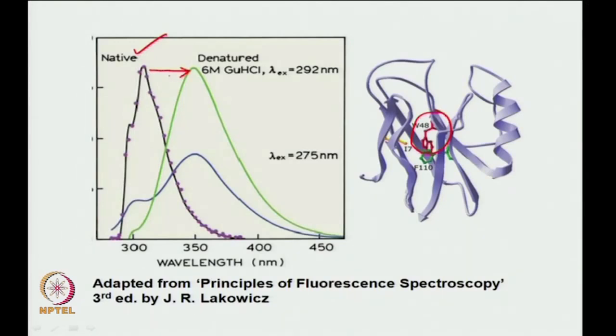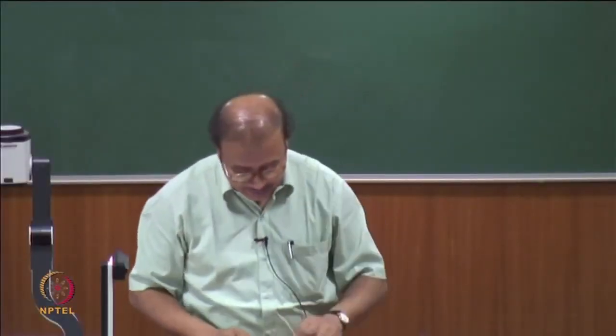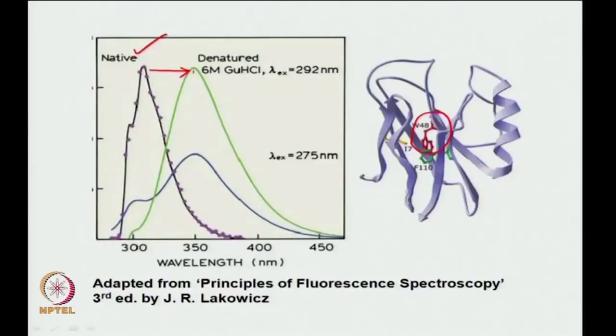Now, guys, remember all those stop flow kinetics we talked about, and we talked about a certain change in spectroscopic signal, right? Now, think about that kinetics and think about an experiment you are doing. Suppose you are looking at the refolding of azurin, right? If you are looking at the refolding of azurin, you can do it in 2 ways. When azurin is fully unfolded, say in a high concentration of denaturant, its emission maximum would be close to, say, 352 nanometers or so.